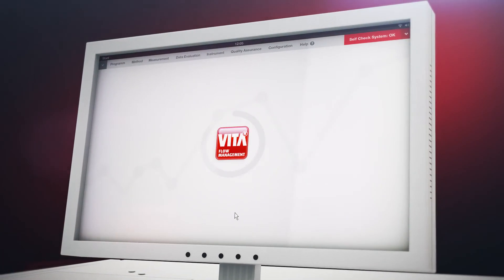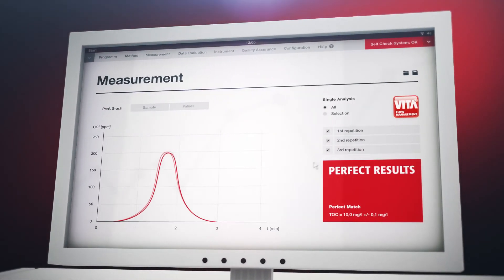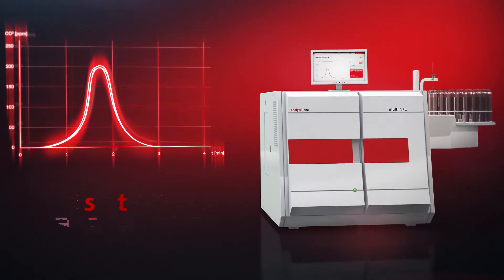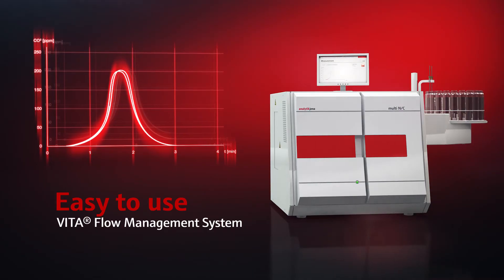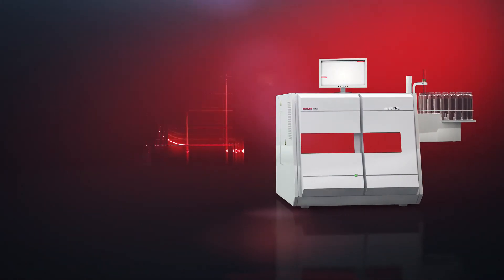The Vita flow management system efficiently compensates gas flow fluctuations and allows continuous tightness control of the entire system. Thus, Vita guarantees highest operating safety and perfect analysis results.